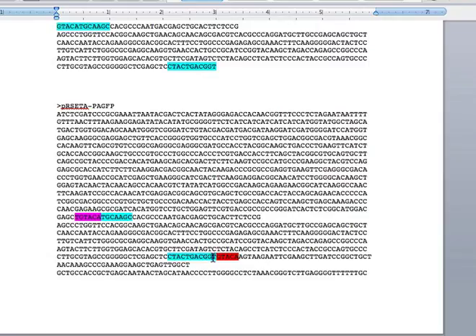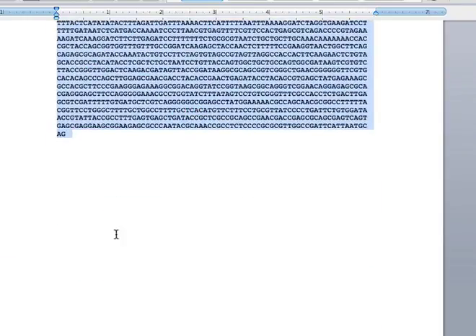The same thing down here. In blue there's a T, and then the GTACA is in red. But now we have the restriction site again. So when you clone into it, you restore the restriction site and you gain another one on either side of the insert. Now we need to analyze this. And so I'm going to copy the whole new structure, and go to BLAST.